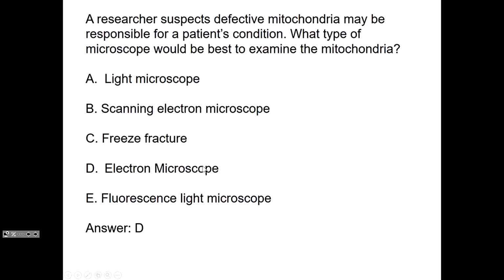Because you scatter electrons on the surface of the structure, and I guess the electrons bounce off onto some apparatus that captures the scattering of the electrons, which then is captured as an image. And I guess by practice, they tried different structures. They also use carbon sometimes, and there's probably other stuff as well. And they've just found that gold is the best, a fine mist. And also gold, you can make a fine mist of it.